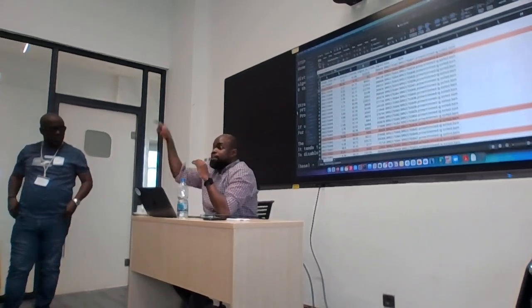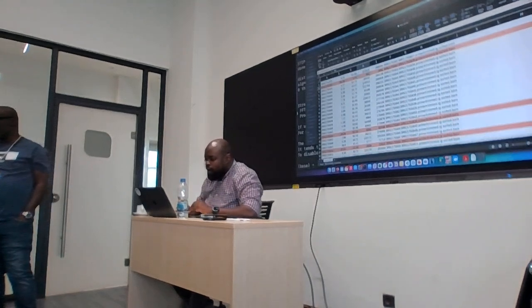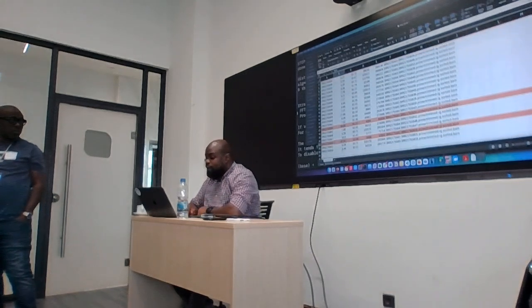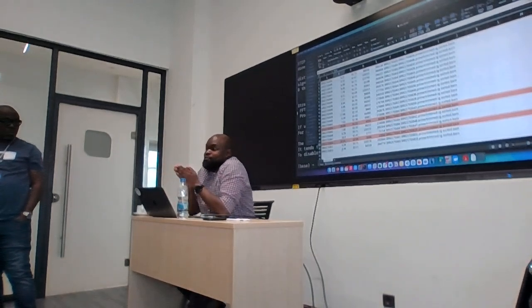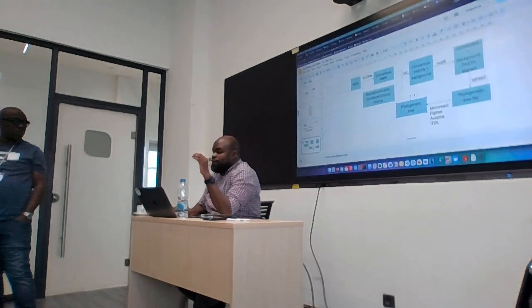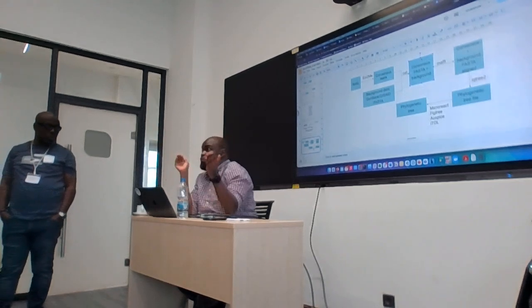So, this is an iterative process. You might generate a tree, you come back and say, okay, I want to remove this one because it is very low quality. And also maybe this one. And also maybe this one. Okay? And then generate the alignment again. Or sometimes you don't need to generate the alignment again. I don't want to confuse you. You might just go back to this file and remove those sequences only. Then you proceed.